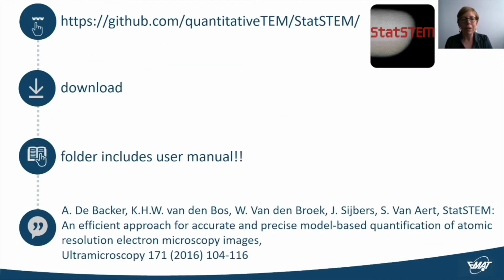Much work has been done by team members over the years to implement this parameter estimation algorithm into our open source software, which is called StatStem. The software can be downloaded from the following link, together with a user manual. And more details can be found in this Ultramicroscopy paper.